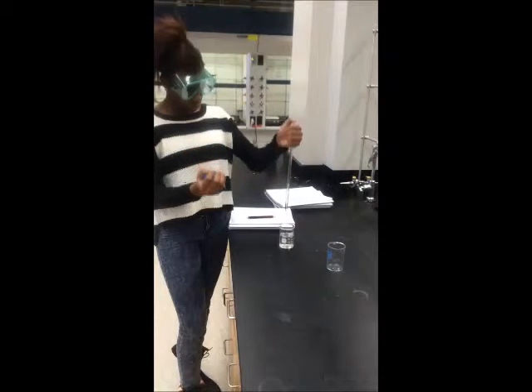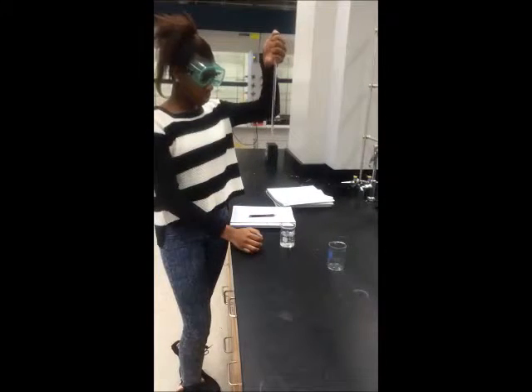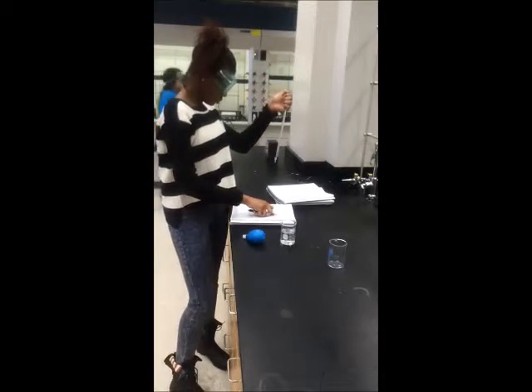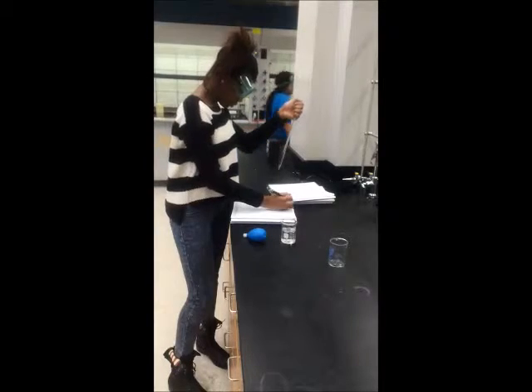Just like it was mentioned earlier in the video, you want to read at eye level and record it to 1 degree of uncertainty. Be sure to record your data. This will be your initial volume.